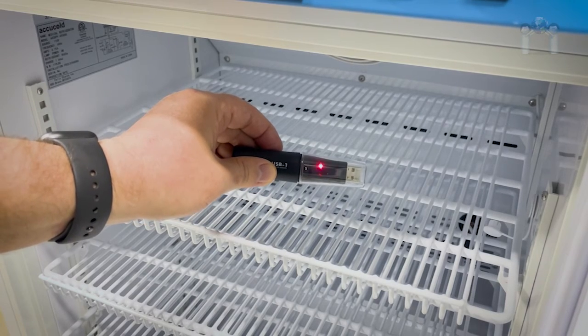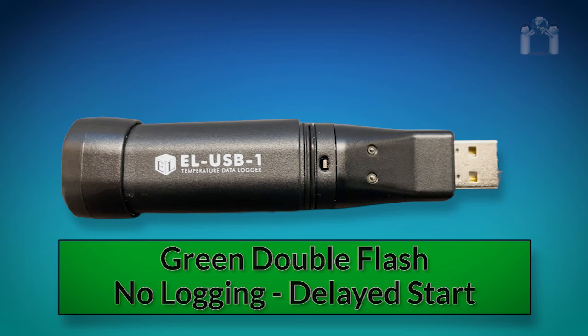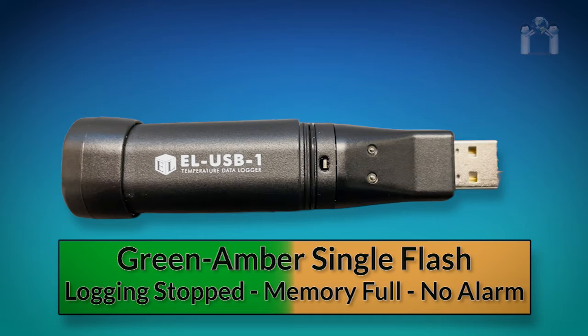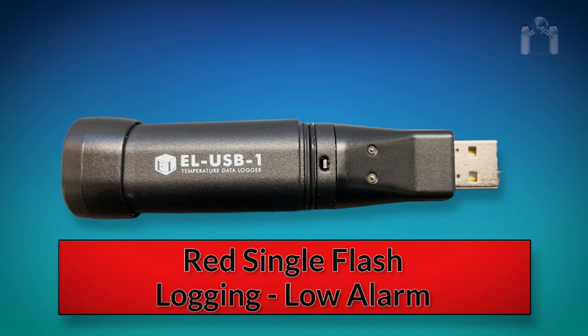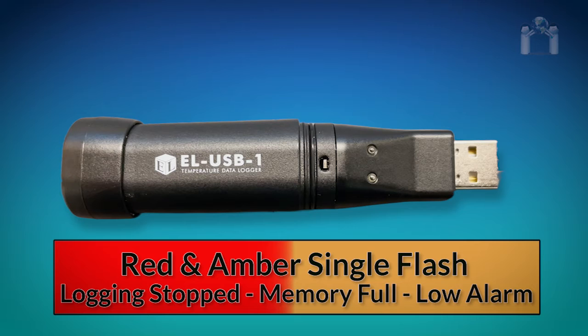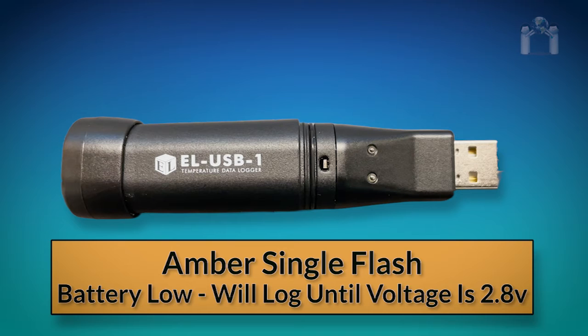Periodically, you will want to check the thermometer for any alarms. A green single flash means the data logger is currently logging and there are no alarms. A green double flash means the data logger is currently not logging but is primed to start at a later time. A green and amber single flash means the memory is full and the data logger has stopped logging; however, there were no alarms. A red single flash means the data logger is currently logging but there is a low temperature alarm. A red double flash means the data logger is currently logging but there is a high temperature alarm. A red and amber single flash means the memory is full and has stopped logging, and a low alarm was also triggered. A red and amber double flash means the memory is full and has stopped logging, and a high alarm was also triggered.